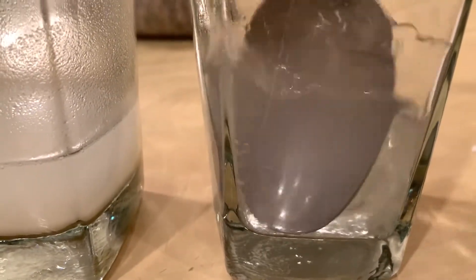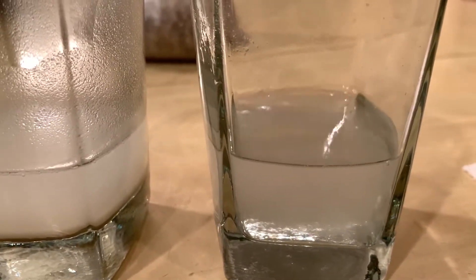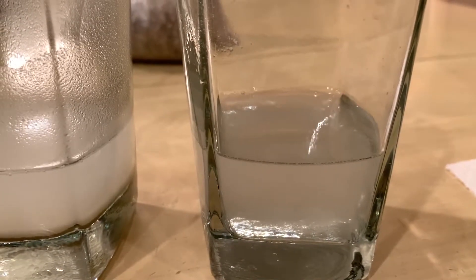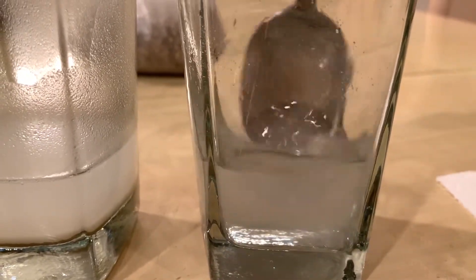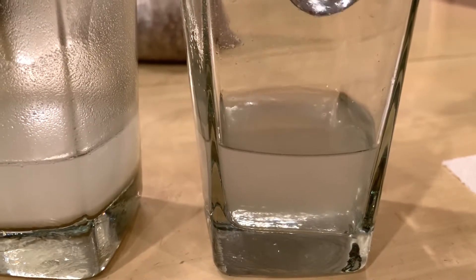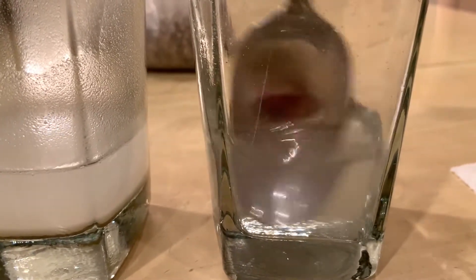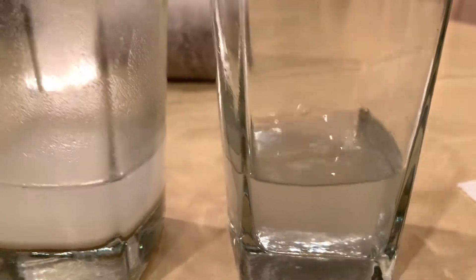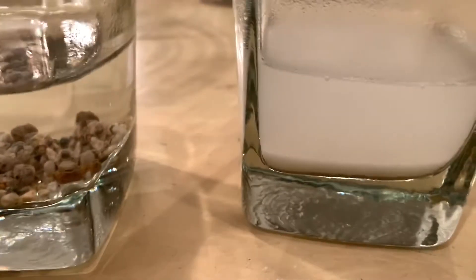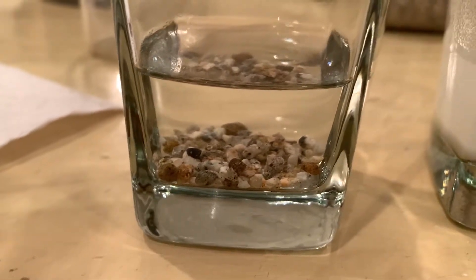It looks like the salt isn't really dissolving that well. Quick question: what do you think we could do to the water to make more salt dissolve? We'll talk about that in a later lab, but there is actually something you can do to make the water hold more salt.